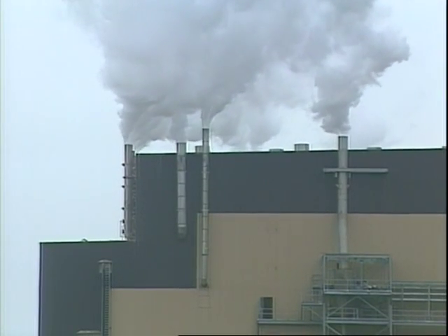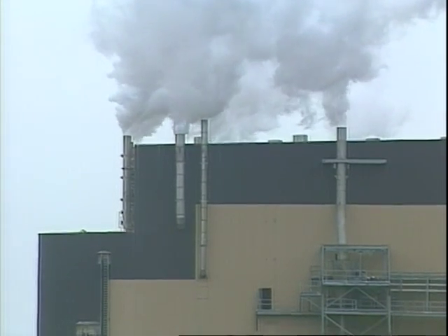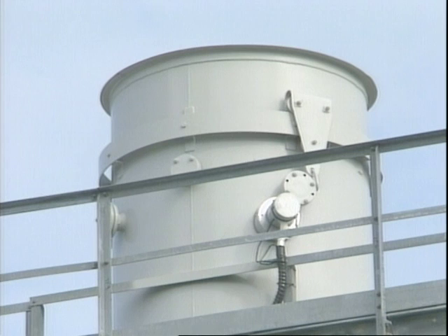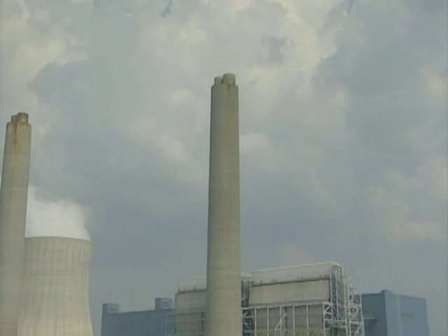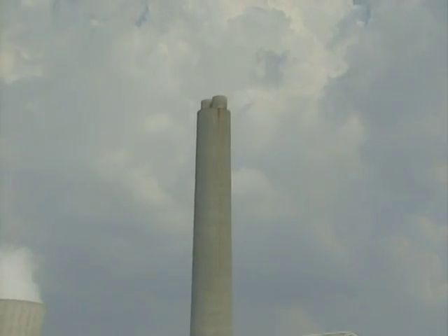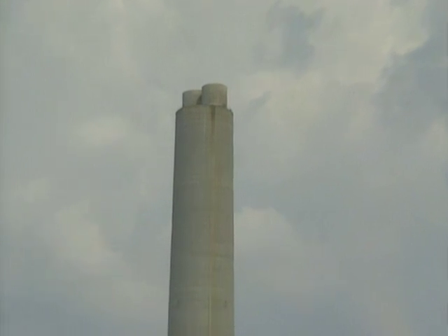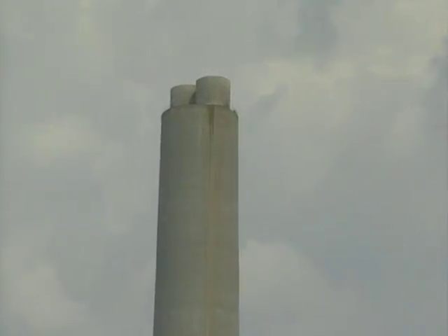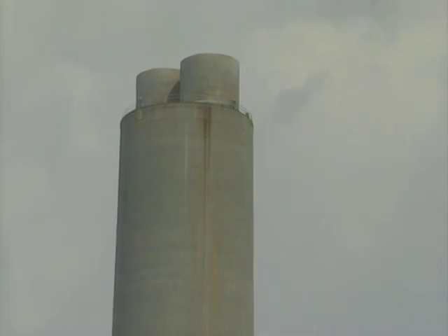Single-beam open-path analyzers measure concentrations of contaminants in ambient air. They are commonly used to analyze process emissions from smokestacks. This is known as across-the-stack monitoring. It's difficult to calibrate this type of analyzer because the smokestack acts as the sample cell, and it cannot be filled with calibration sample. Instead, filters are often used for calibration, but they may lack reliability.